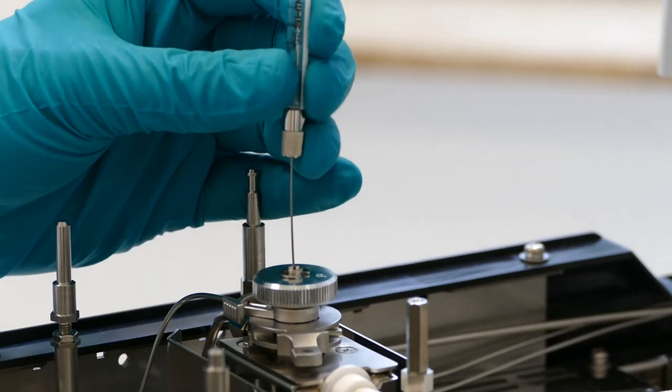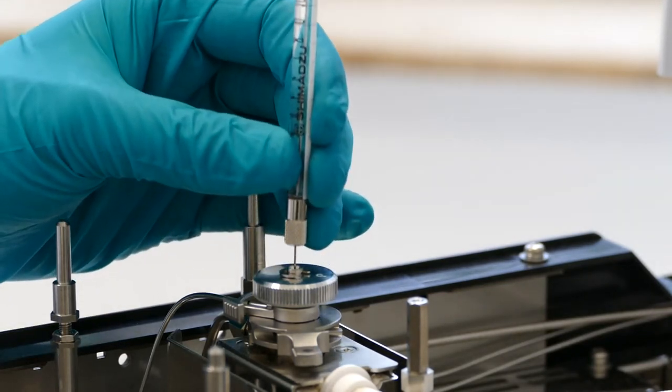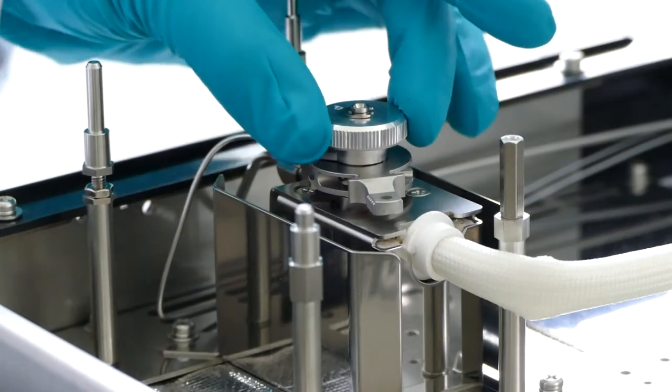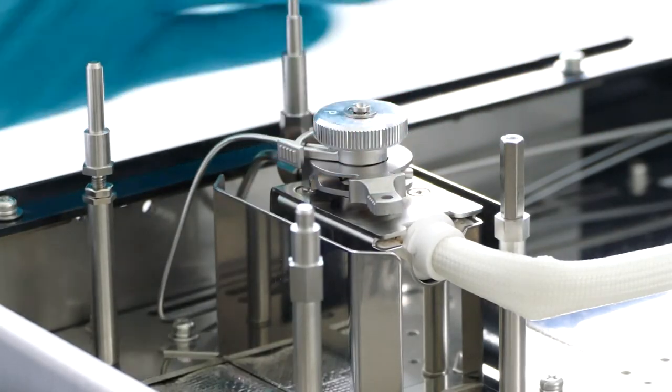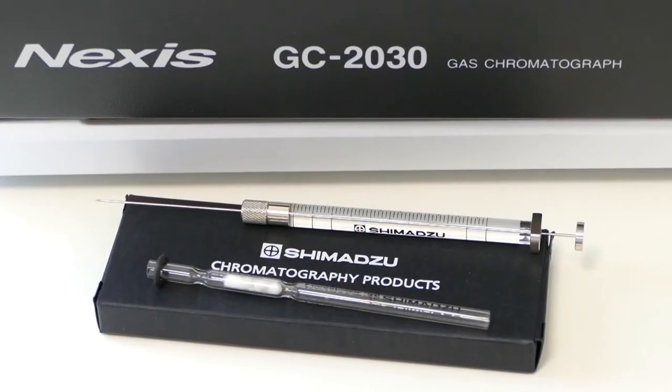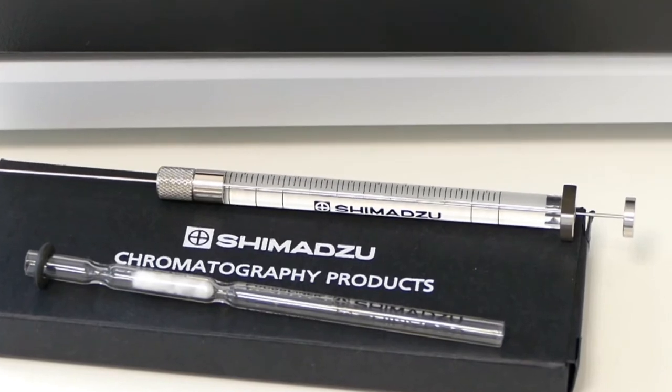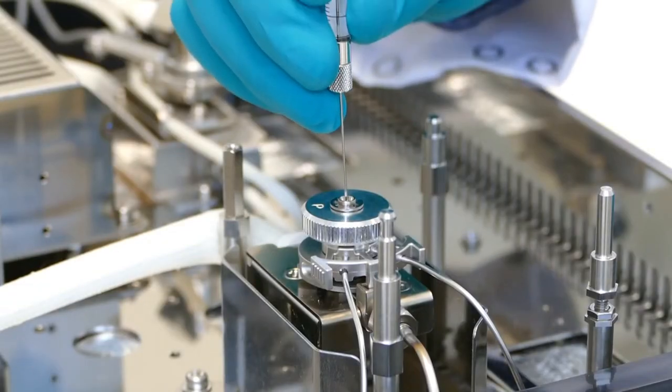A needle guide ensures the syringe can pierce cleanly through the septum. The retaining screw is hand tightened and then loosened by a quarter turn to allow the needle to slide through with ease. A syringe can then be used to test the septum is installed correctly. The needle should slide through the septum without resistance.